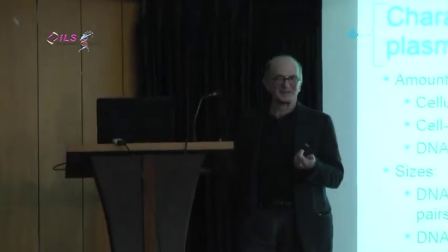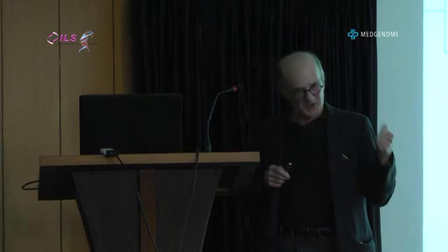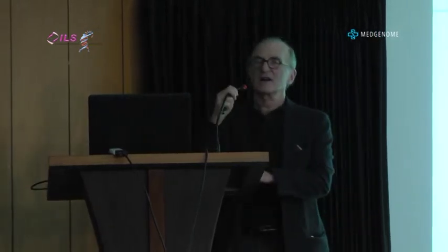You know, we don't have nucleic acids. We can start with one molecule, as you'll see momentarily. With protein, you need a lot of material, and it's hard to do it. So we don't know. Okay? And this has been seen in 3 or 4 different clinical presentations. So it's a general phenomenon, but nobody has an explanation for it. So that could be a very good marker to quantitate your... Unfortunately, although the mean size shifts, the distribution is broad.